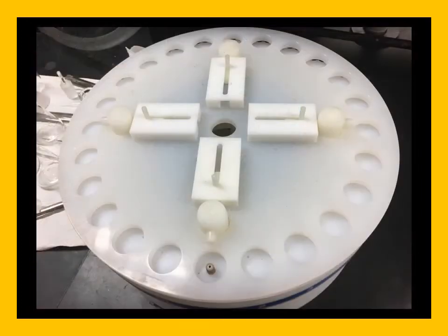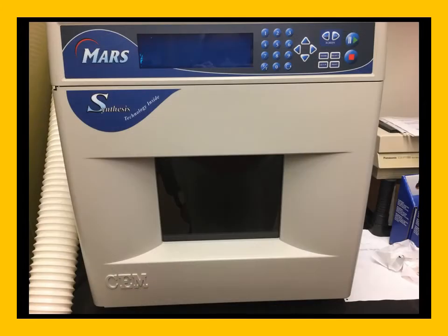Now we're securing a lid. This lid is secured on, so should something go wrong and there be a glass explosion, it only affects a single sample vial, and we do not have glass flying around the microwave. We contain the glass into one slot. Here is the microwave. It's not our normal household chemical microwave. The white tube on the left-hand side is used to vent the gases into the hood.